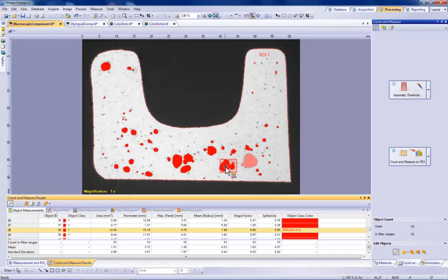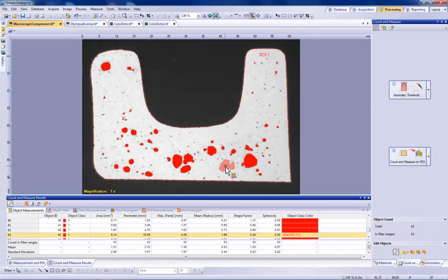When there are objects that are touching, the software will detect them as one, but if they should be separate objects, we can simply split them using the Auto Split function. First, we have to select the object or multiple objects to highlight them. After the selection has been made, we simply right-click on the object to bring up the Selection drop-down menu. We can select Auto Split Selected Objects from this menu to run it. Now we can select the individual split objects by clicking on them.